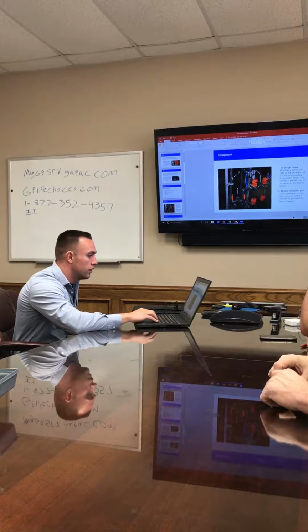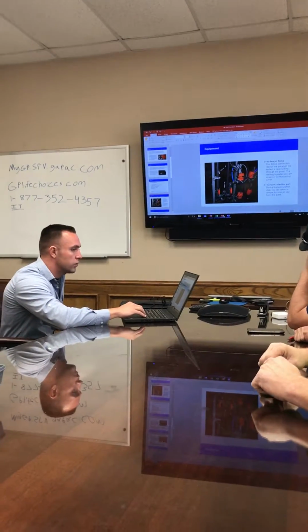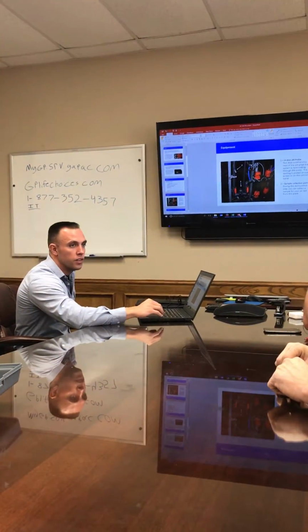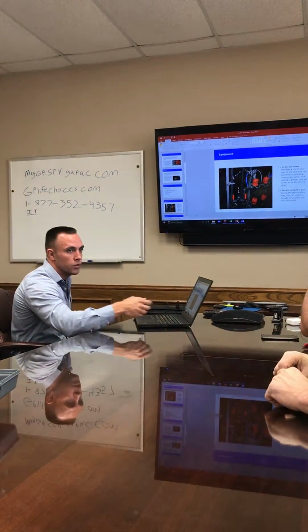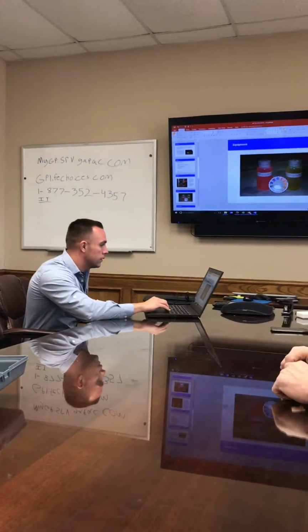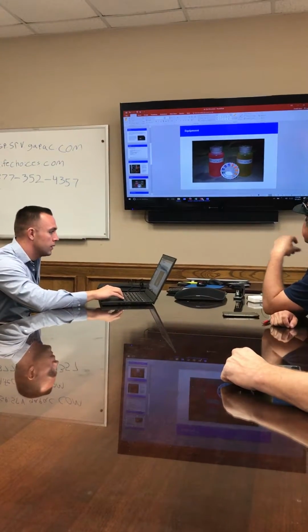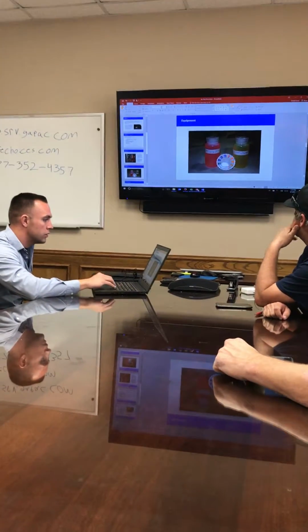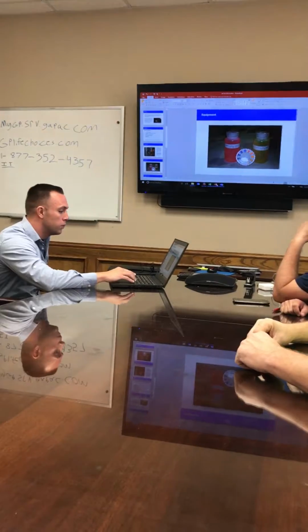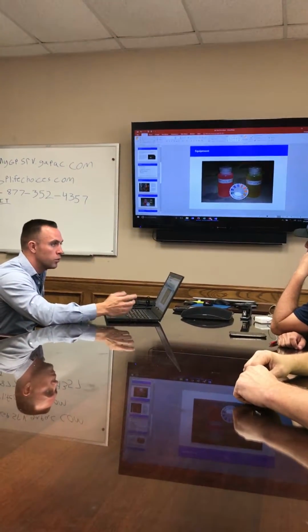Sample collection port. During the recirculation step, you can collect a sample for your jar test from this point. You guys have that as well. Sometimes it gets a little plugged up, so if you want to grab the sample from the top, it's not a big deal. I think that's where we're getting our samples from, right? Yeah. Top, yep. This is some pH buffer to calibrate your pH probe. And that's the pH paper, but you guys are using the actual probe, so.